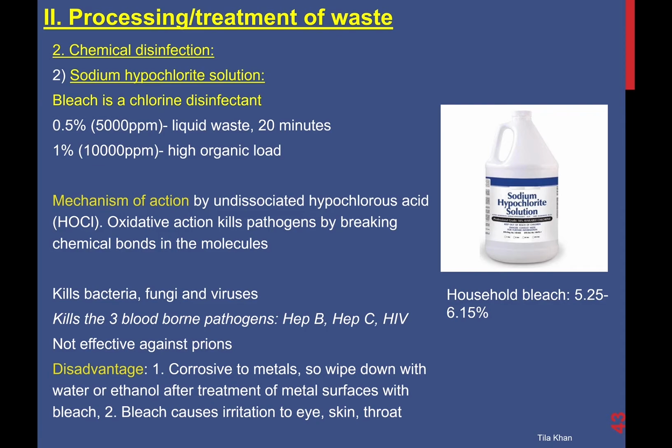And bleach is also an irritant, so it causes irritation to eyes, skin and throat. So whenever you use bleach, please wear appropriate personal protective equipment. You can wear gloves, lab coats, and safety goggles, so as to protect yourself from bleach.